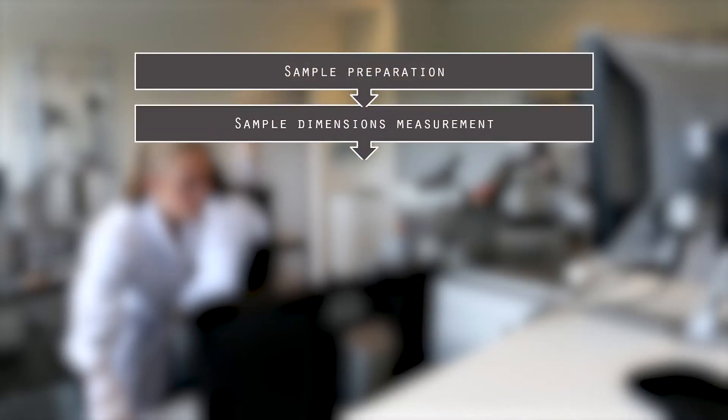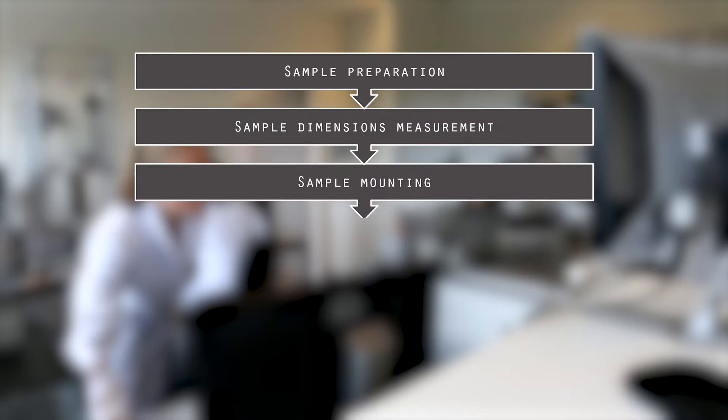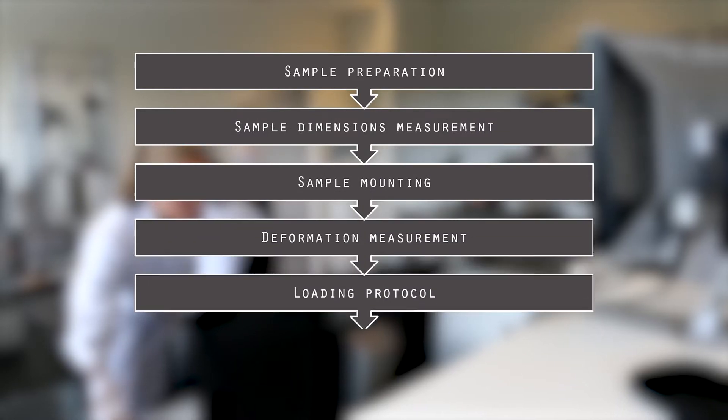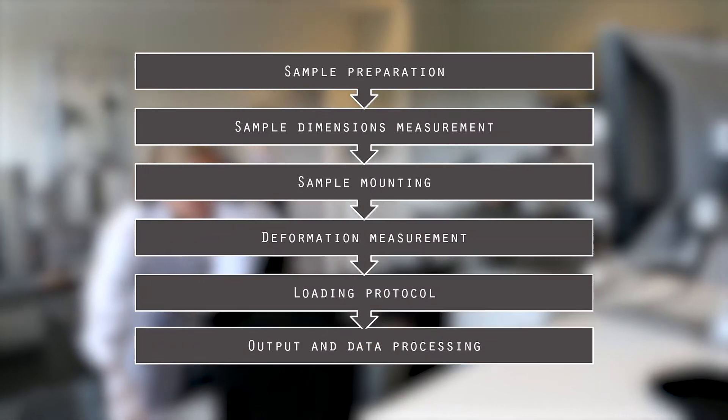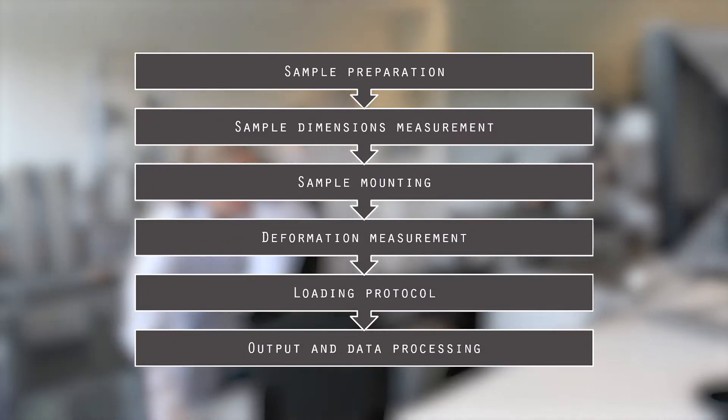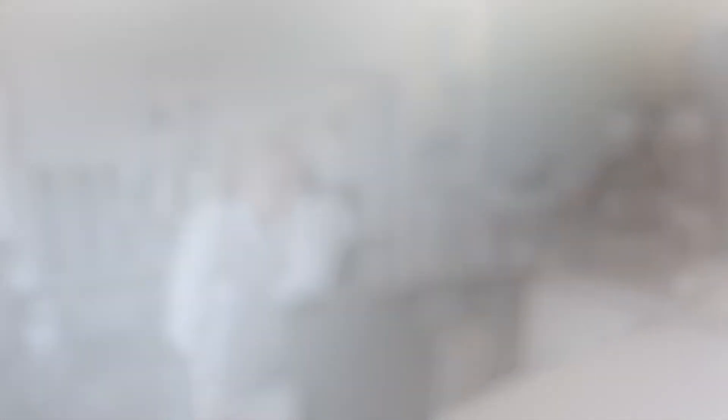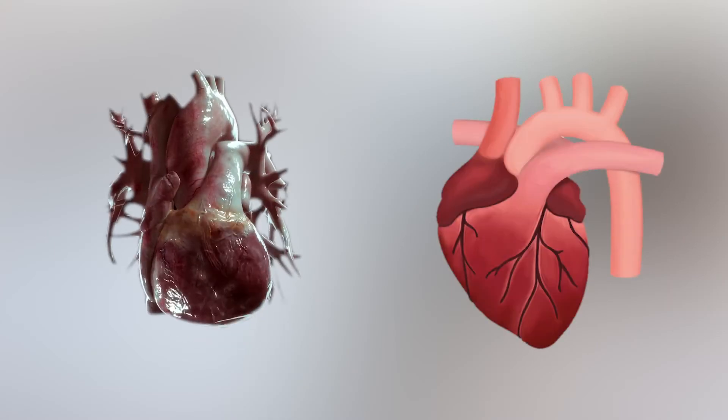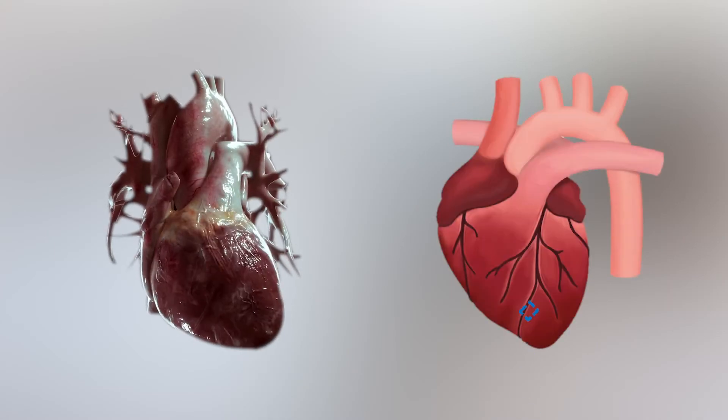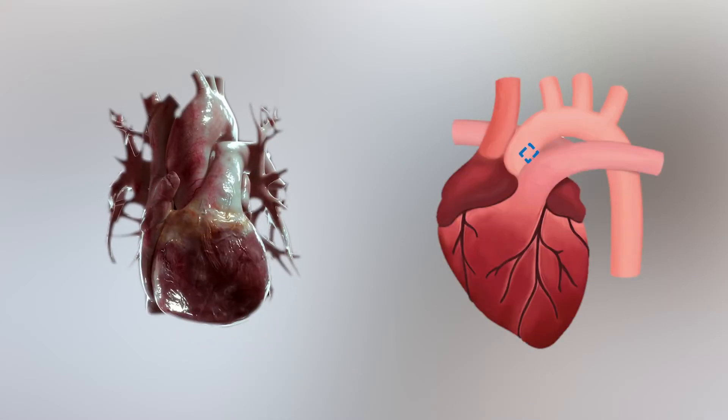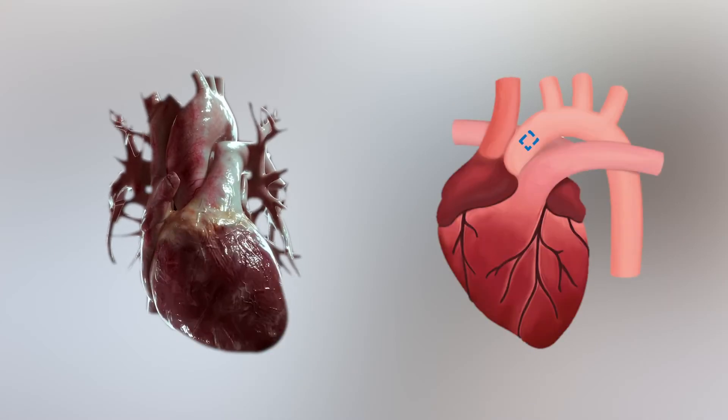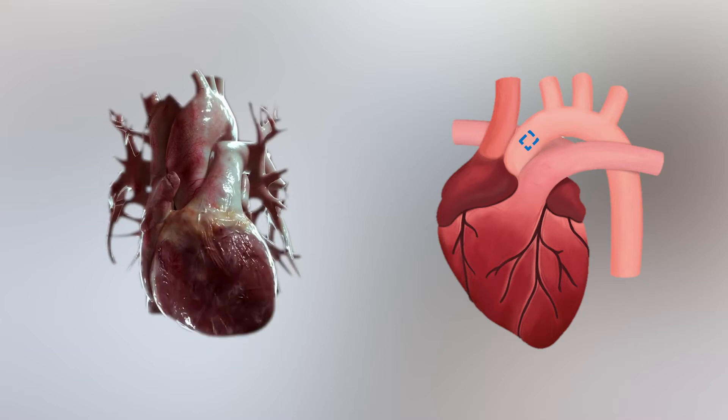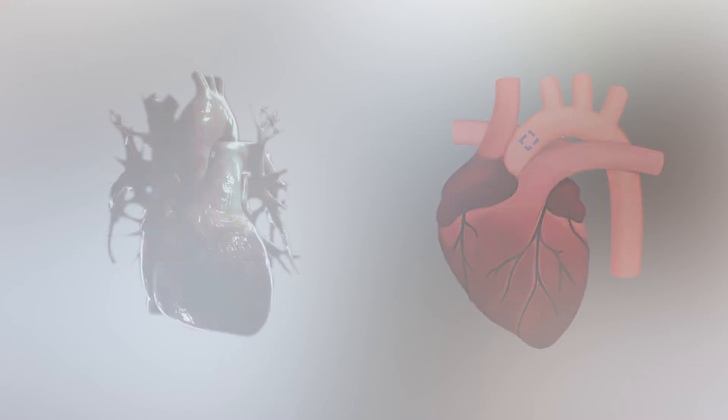This video will guide you through a typical workflow of a planar biaxial tensile test performed at Fiber. We will demonstrate every step for a segment of human ascending thoracic aorta, but the method is applicable to many other tissue types.